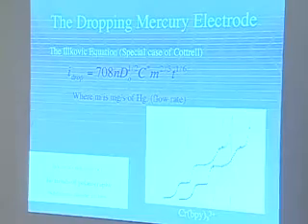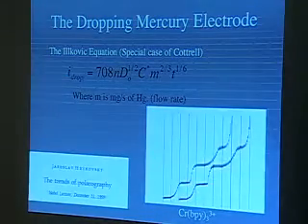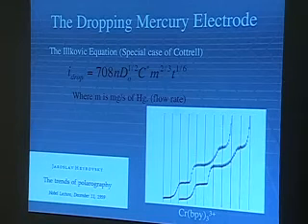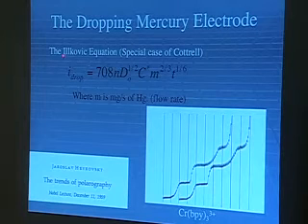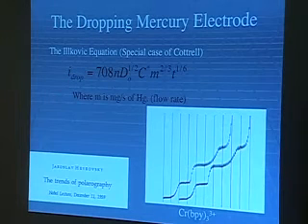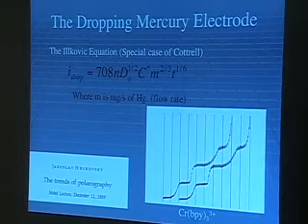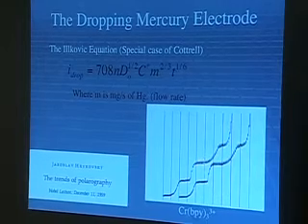Now, what you want to do here again is work out an analytical solution to this, and you could think about situations again where you're mass transport limited, reversible reaction, et cetera, the normal conditions. And that was worked out by a gentleman by the name of Ilkovic, who Heyrovsky refers to in his address. And thus we have a named equation here, which I'm not going to derive for you, the Ilkovic equation. And what it describes very specifically is one of these little transients when you are sitting on this plateau.